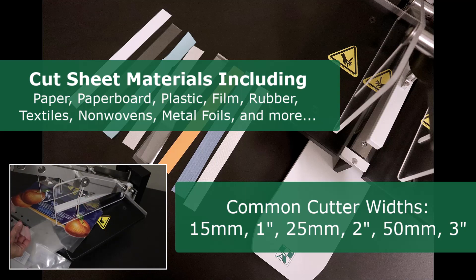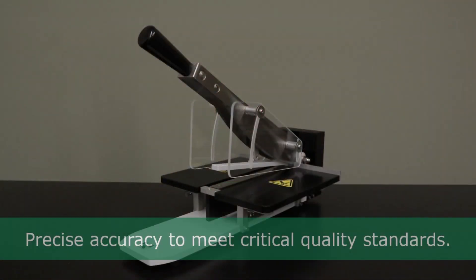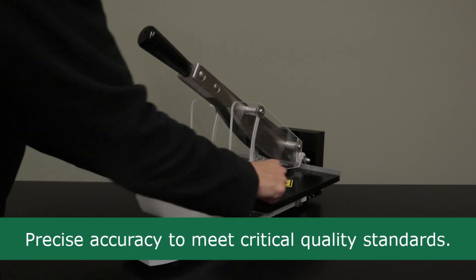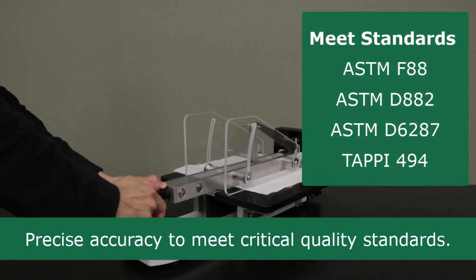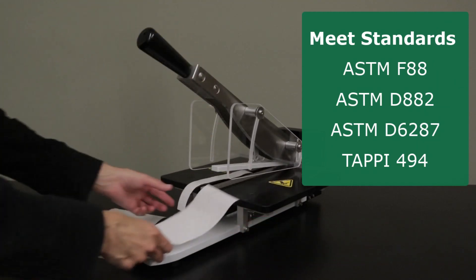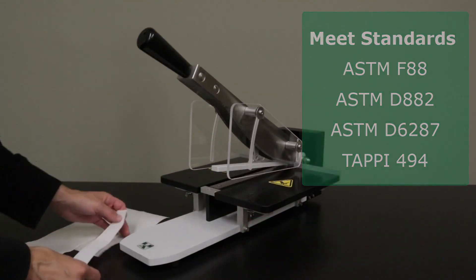The JDC can cut a variety of materials. This precision cutter exceeds common standards requirements for both accuracy and parallelism, including ASTM F88, D6287, and TAPPI T494.